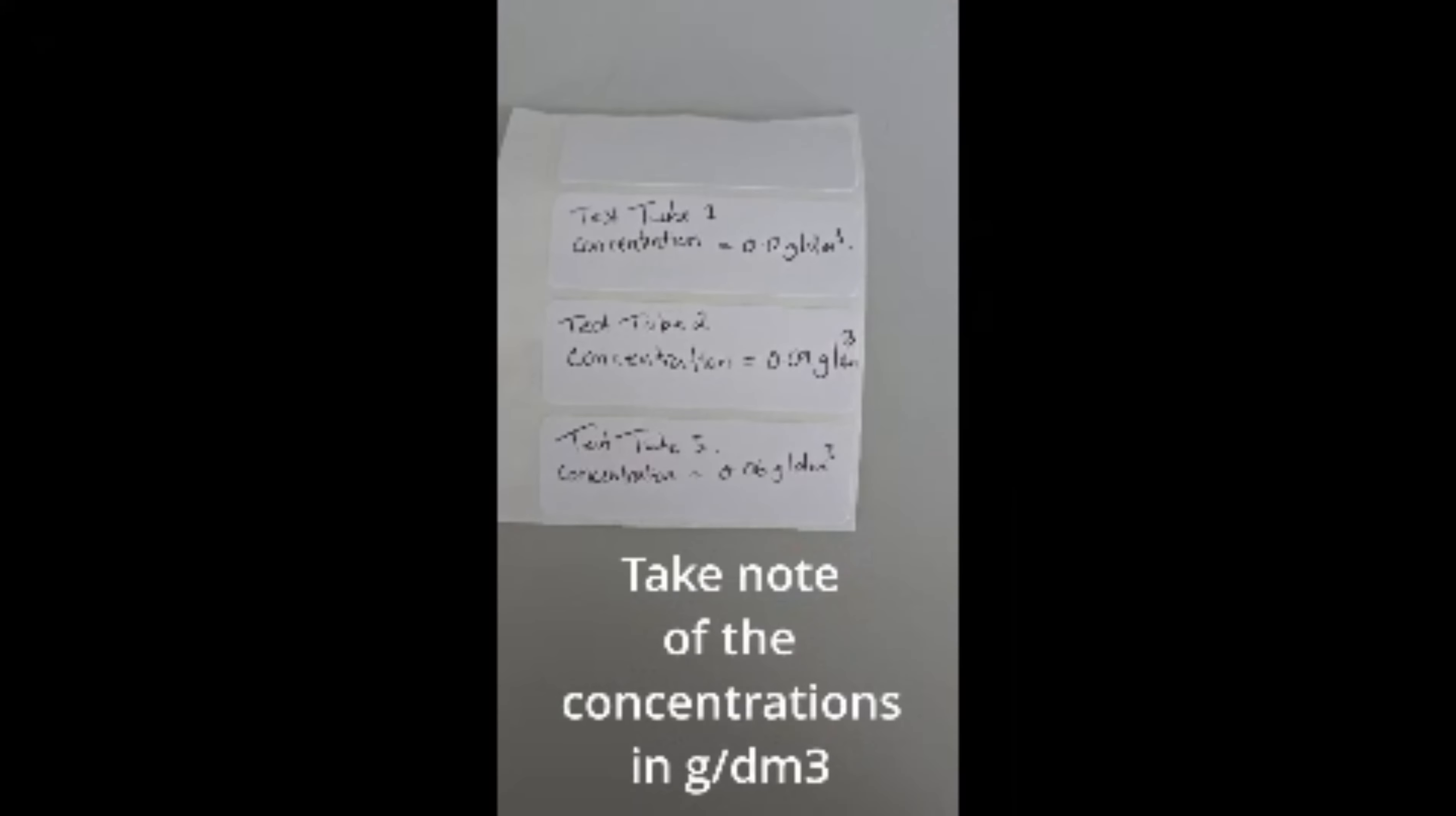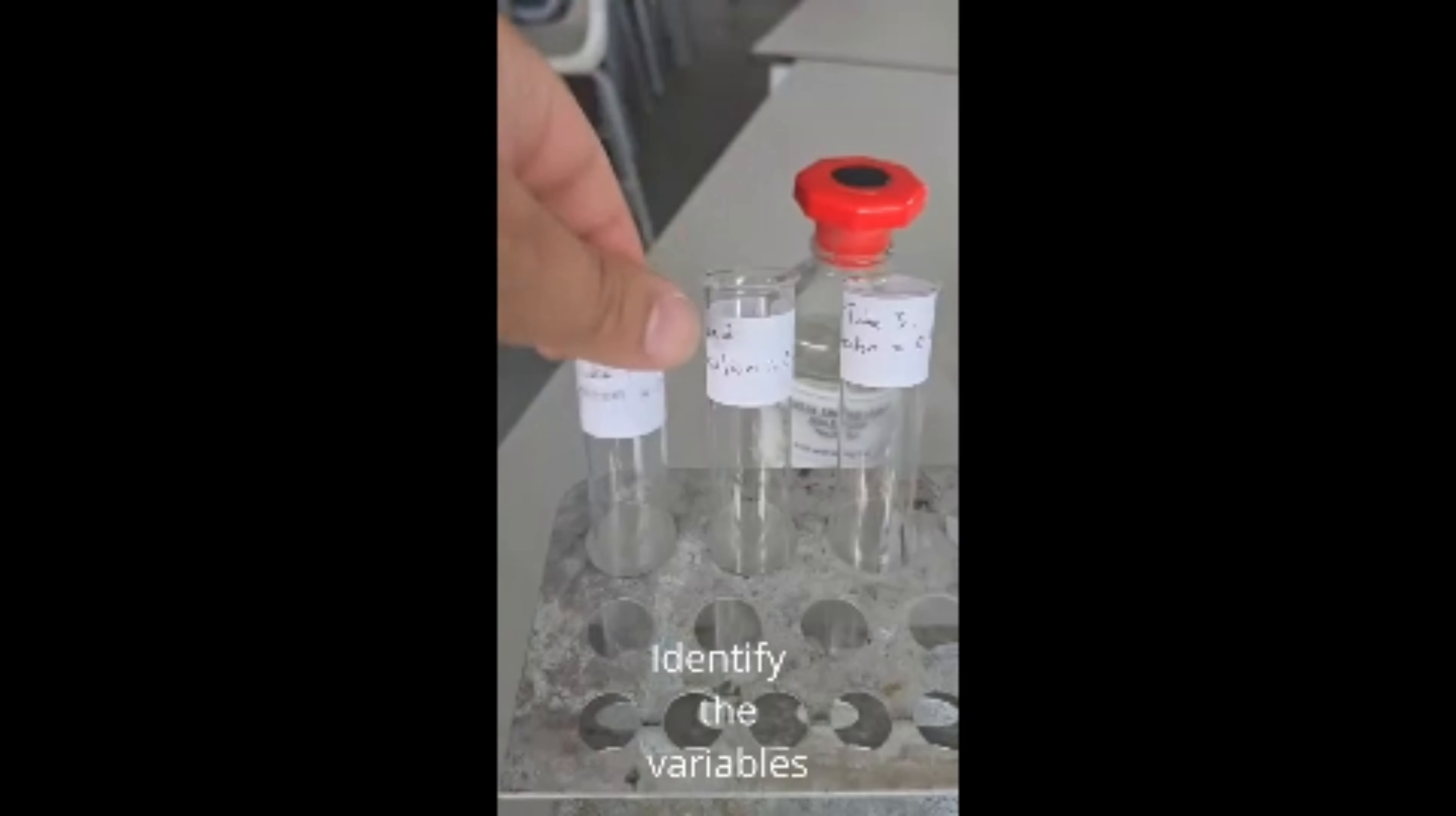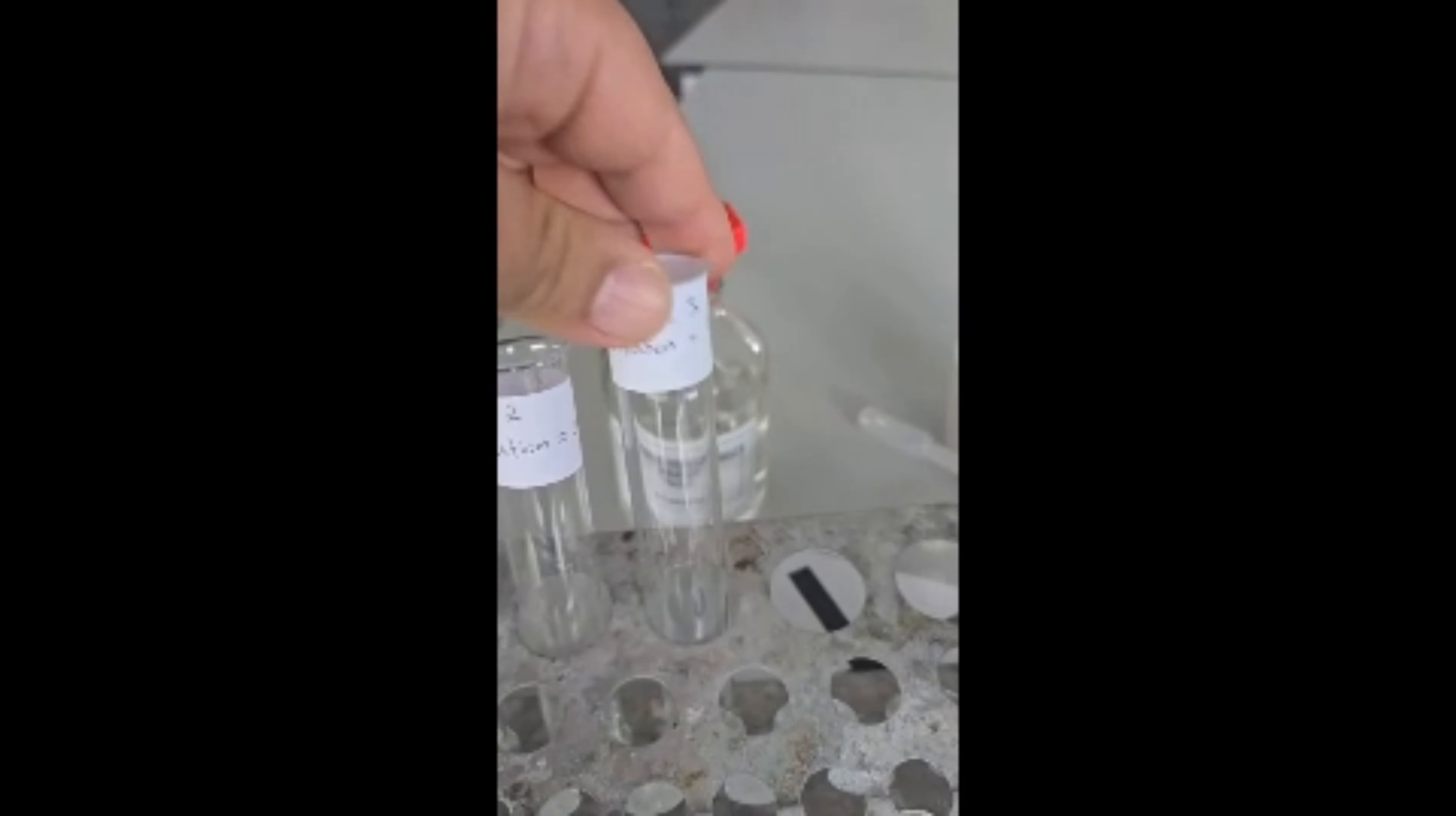Use the three labels to label three boiling tubes which will show the concentration of the sodium thiosulphate. Place the labels onto the boiling tubes.